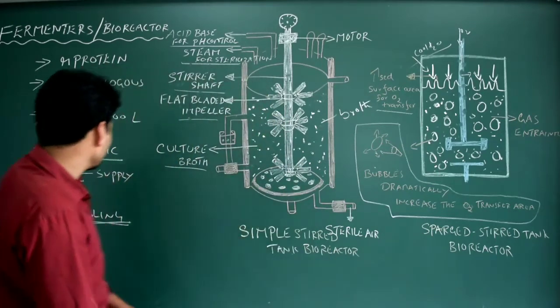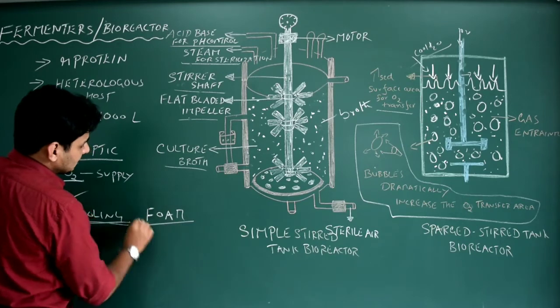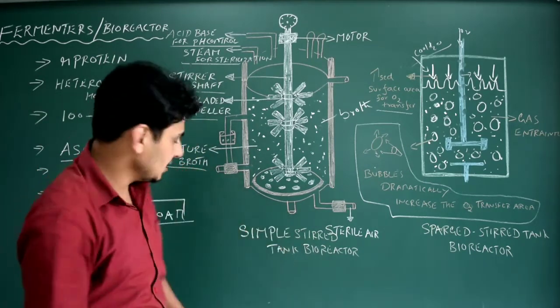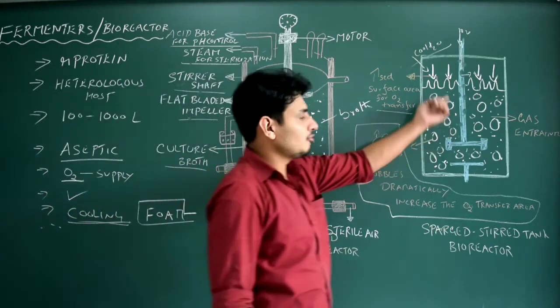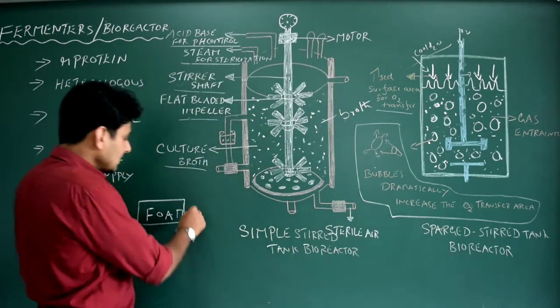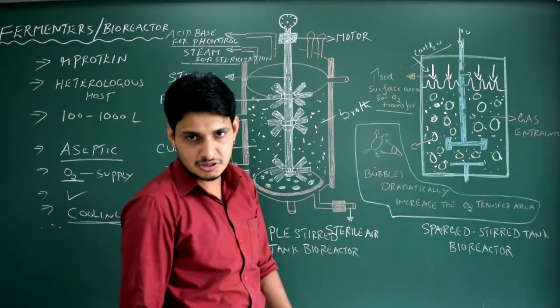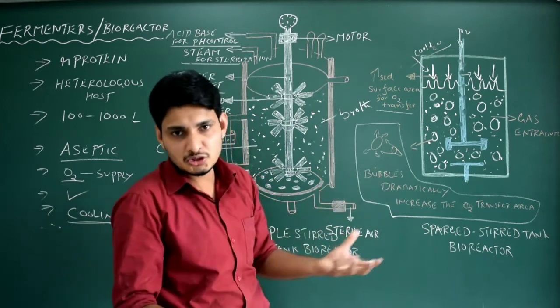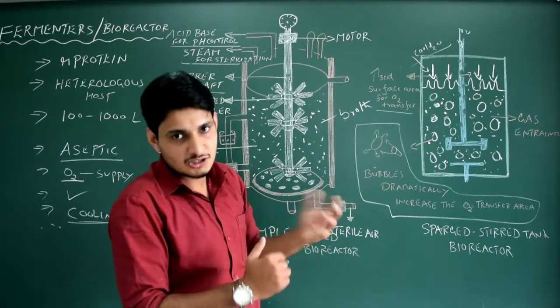I forgot one more challenge you can write down. Because of the continuous agitation in both bioreactors, mixing will be there, so that could create foam. Foam is not good, so we need to remove the foam. It's not easy to remove the foam because it contains microorganisms and nutrients. If I try to remove it, maybe 50% or some portion of the microorganisms will be lost along with the foam while I am removing it. So it's not good.